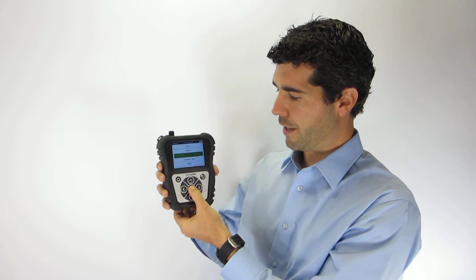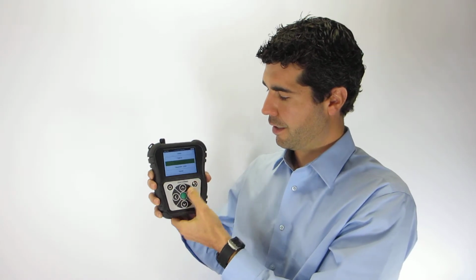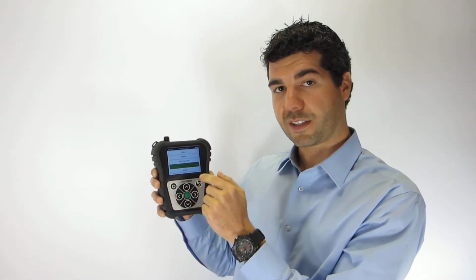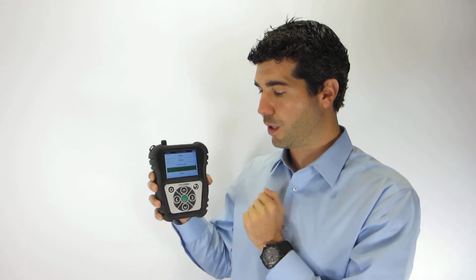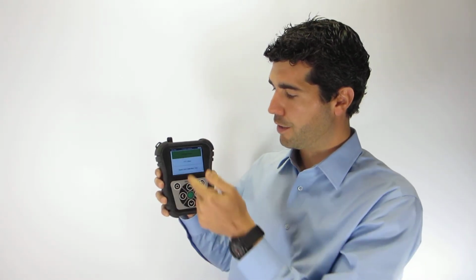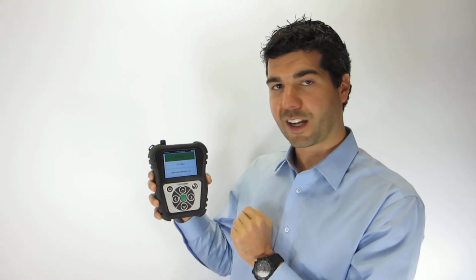Next is GPS live data. This is where you would actually see GPS live data feeding in if you're outside and we could see satellites. From there, there's a diagnostics test. Once you press that, it will actually go through a full diagnostics test of each system of the Seeker. This is automatically done at the startup, but if you wanted to initiate it manually, this is how you would get there. And then last is the admin menu. This is where you would actually erase the menu, set the time zone you're in via the UTC offset, and do a blank card calibration test.